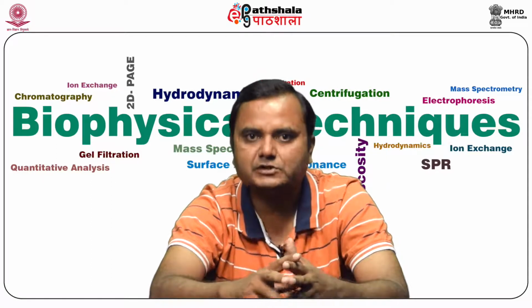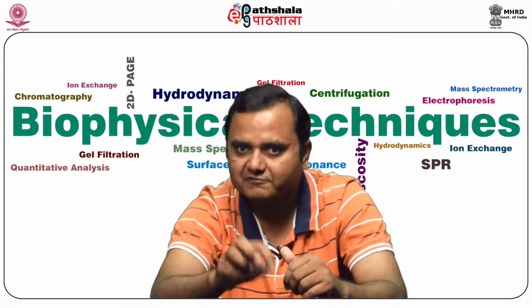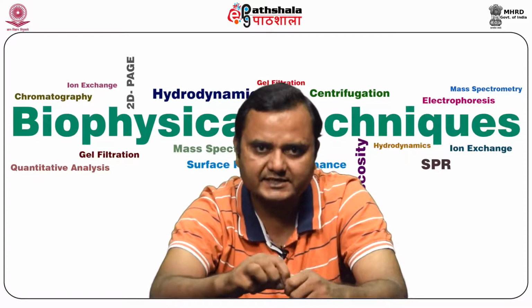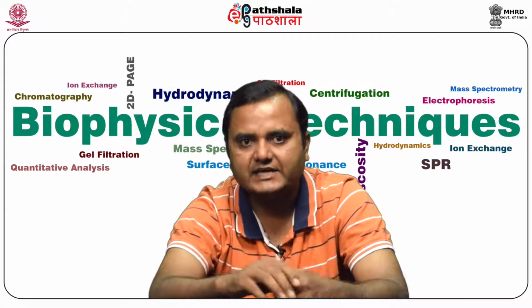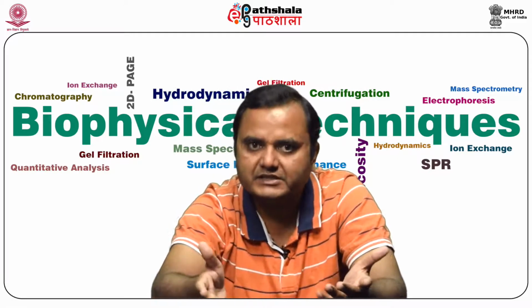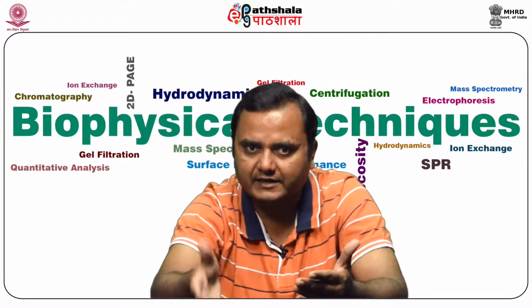The separation depends predominantly upon particle mass and particle size, where heavier particles or cells settle first at the lower G value. Like intact cells can sediment at around 800 G, and less heavy or less dense particles settle later.